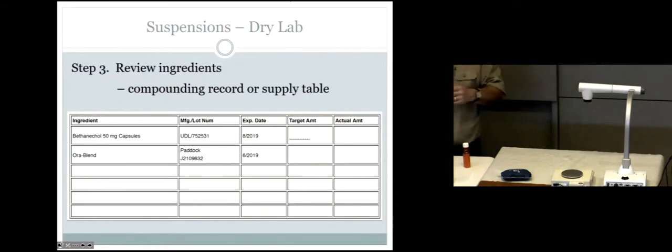Would you agree? You have a couple of things you could use to not only sweeten it, but to give it a flavor. There are a couple of things, especially the Aura Sweet, which is what you're using today, so you'll see and kind of smell what it's like today. That definitely would make it flavorful, but not necessarily to a specific flavor. Why would you not want to give it a specific flavor? Well, does everyone like cherry, or does everyone like grape? Not always. And sometimes certain drugs are more bitter and are masked differently with different flavors.